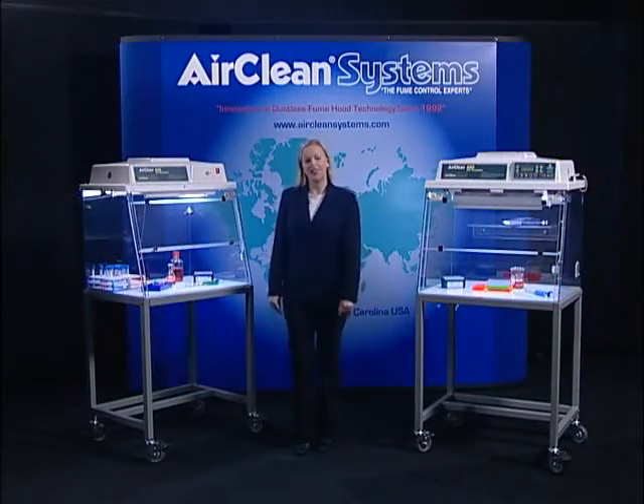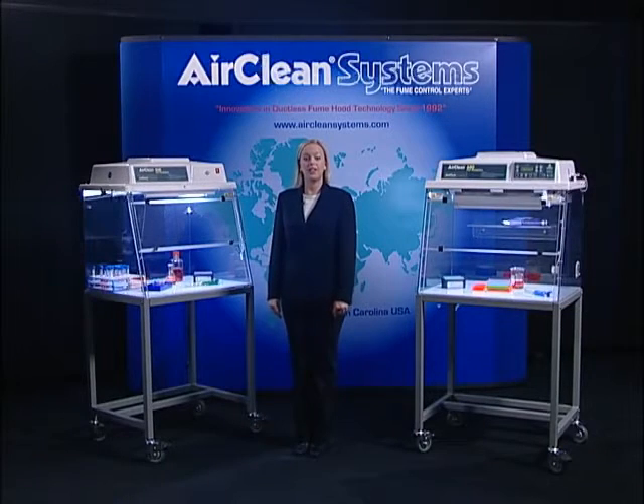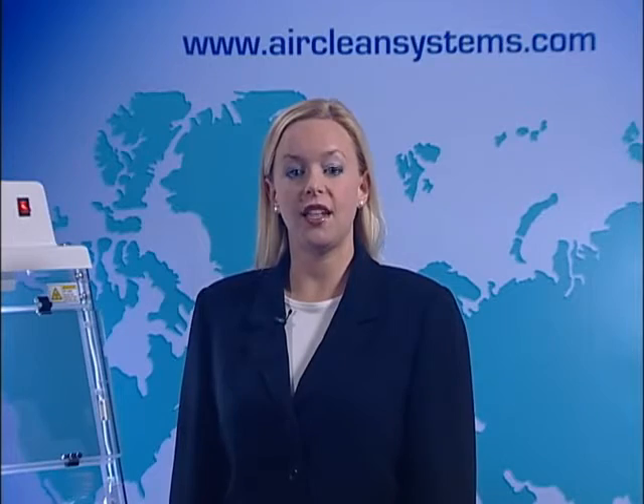Hello! AirClean Systems would like to thank you for your interest in our PCR workstations. We hope this video will provide you with the necessary information you need to evaluate our product.